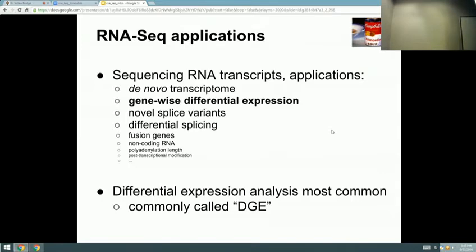So the other applications for RNA sequencing, when I'm interested in more than simple group comparisons. So what is everyone else working on if they're not working on simple comparisons? Does anyone have a good example? Of other RNA-seq applications if you're not doing simple comparisons between groups. Anyone?